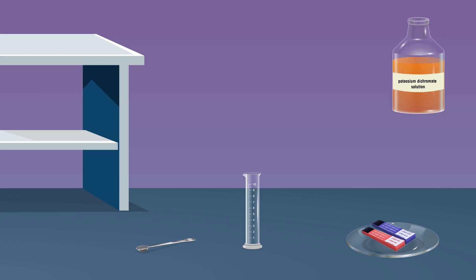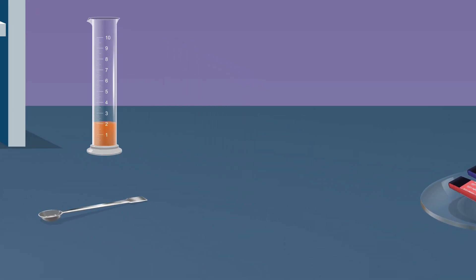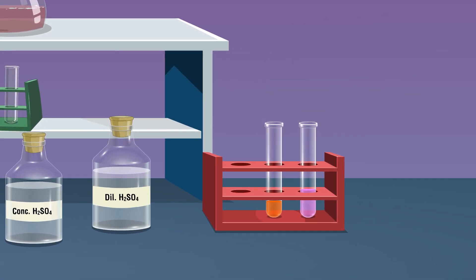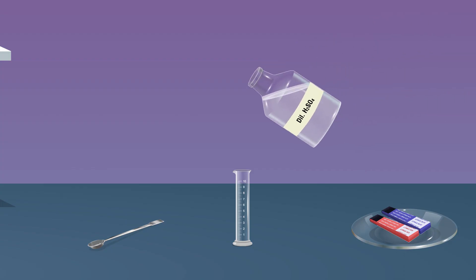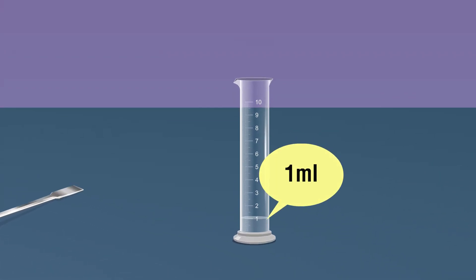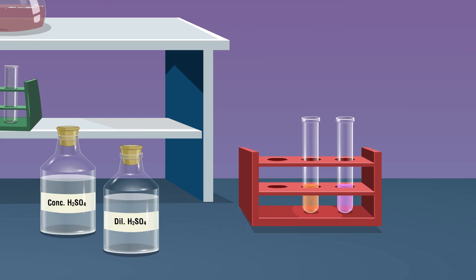Take 2 ml of potassium dichromate solution in a measuring cylinder and pour it into a test tube. Wash the measuring cylinder after each use. Take 1 ml of dilute sulfuric acid in the measuring cylinder and pour it into the test tube containing the potassium dichromate solution.